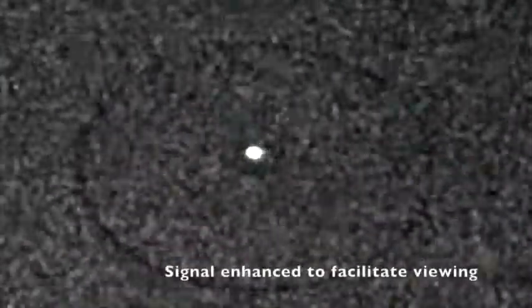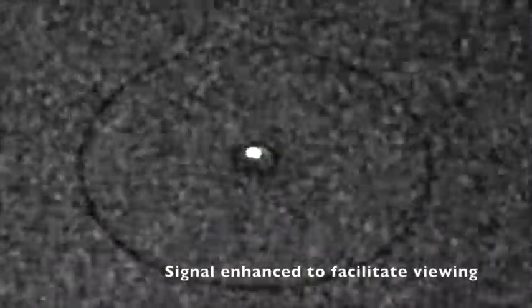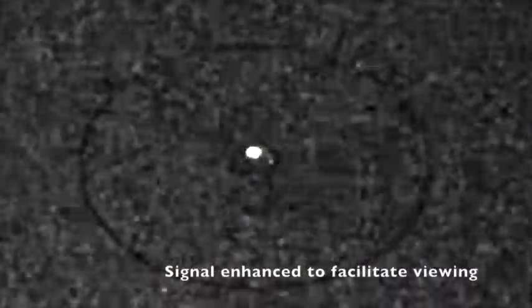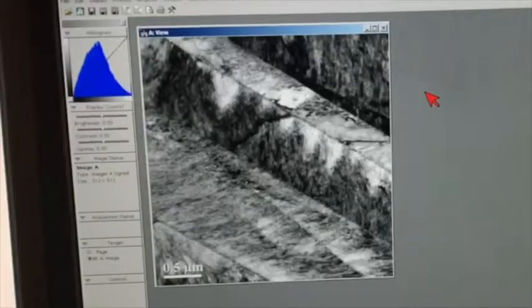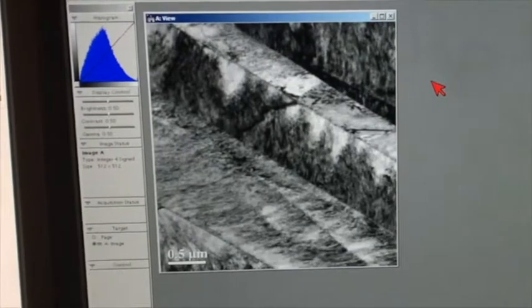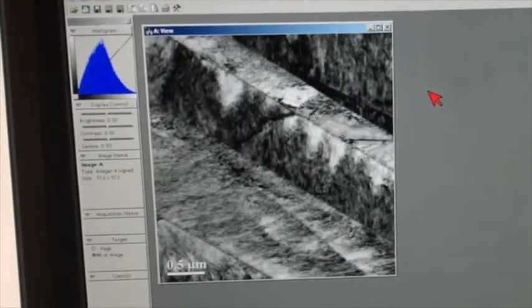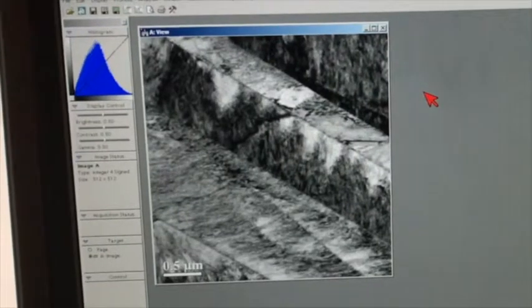After moving the objective aperture over the transmitted beam, we can hit the Diffraction button again to exit diffraction mode. When doing the objective aperture alignment, this is the only time we insert both the objective aperture and the SA aperture. After the alignment, we can remove the SA aperture. Converge the beam a little bit. You can see that with the smallest objective aperture, you get the best contrast, but you sacrifice the signal-to-noise ratio.